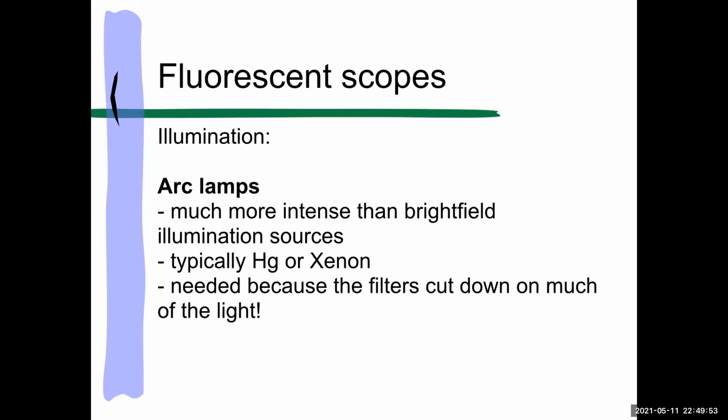And so they're way more intense than just a bright field scope, and they're way more delicate. They require turning on and leaving on for half an hour and turning off and leaving off for half an hour. They can explode and create toxic mercury gas that would lead you to evacuate the whole building, explode at the end of their lives, or if they're just unhappy. Fortunately, they infrequently explode, but they're not very into being carted around and shaken up and so on.